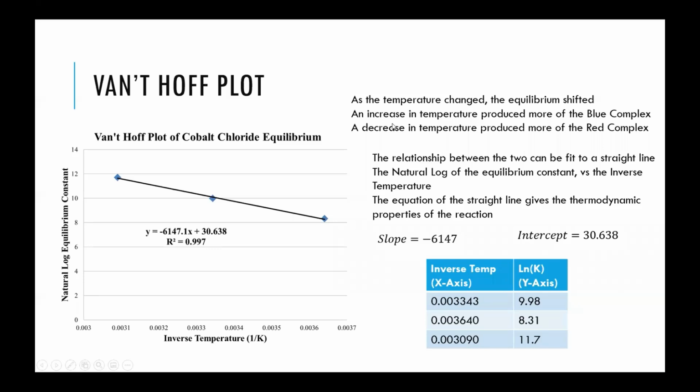So you can see how the temperature, or the energy of the environment, can affect the equilibrium. You can see that in the changing of the color, going from the equilibrium purple, where the 2 different complexes are nice and balanced together, and you increase the temperature, it goes more blue. You decrease the temperature, it goes more red. The temperature plays a critical role in the equilibrium. And because of that, you can relate the 2 large concepts in Chem 2, equilibrium and thermodynamics, based on the energies.